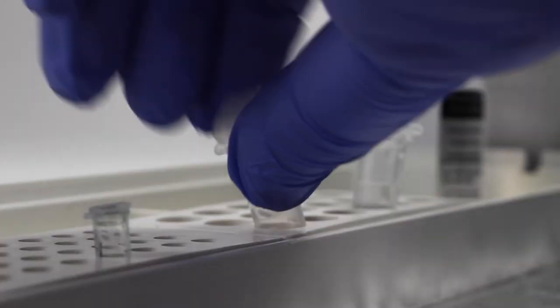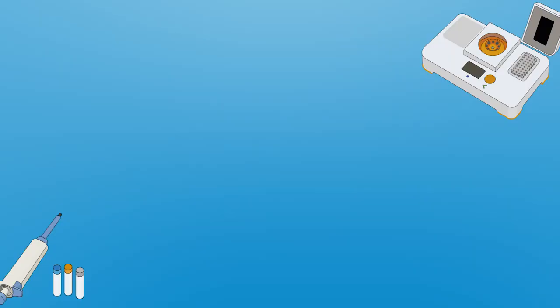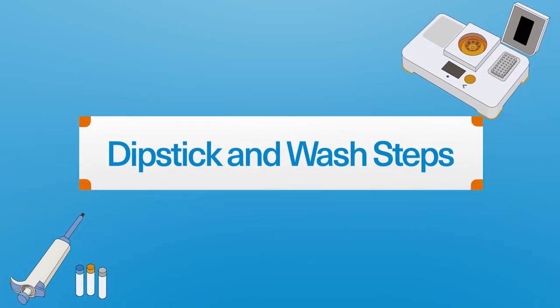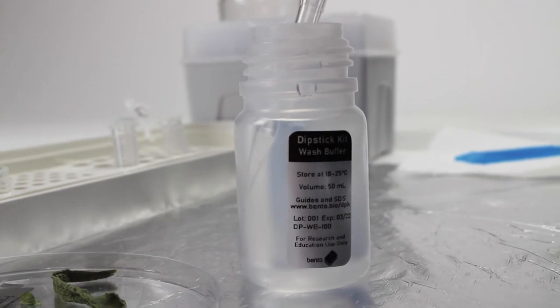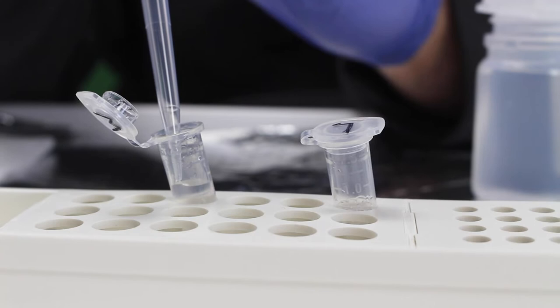Finally, top up with more extraction buffer to a total of 500 microliters and close the lid. Next, aliquot one milliliter of the wash buffer into the second 1.5 mm tube and close the lid.